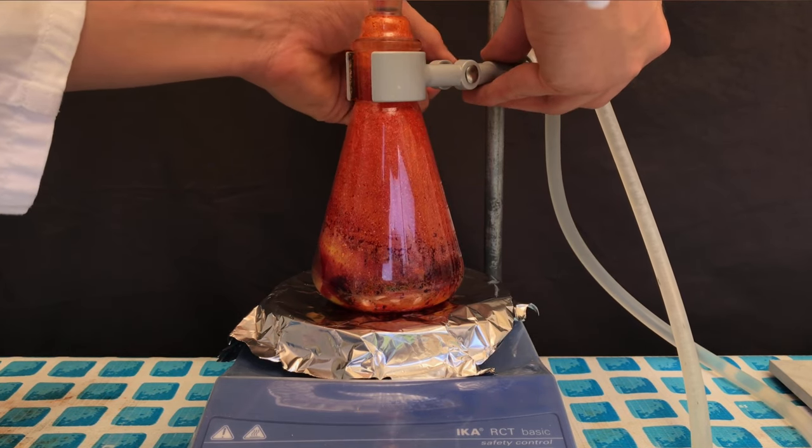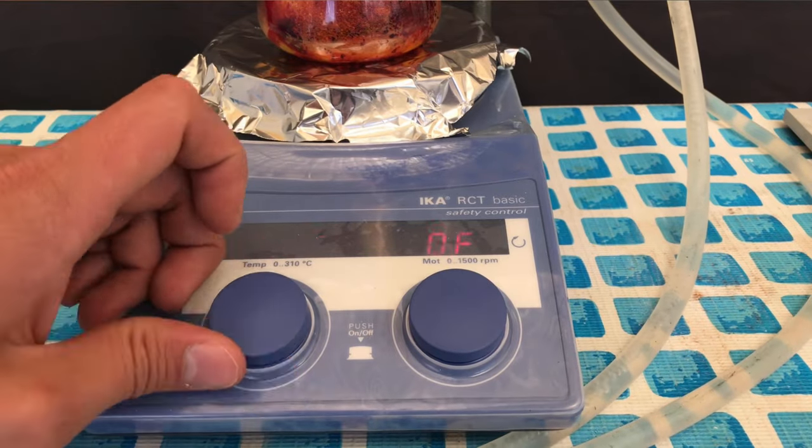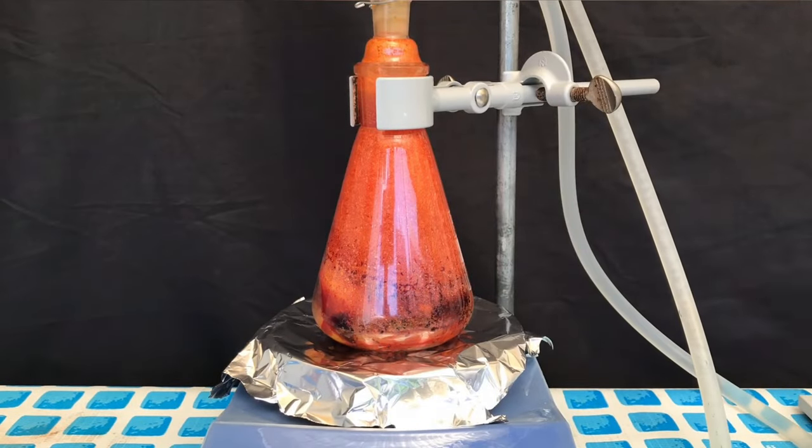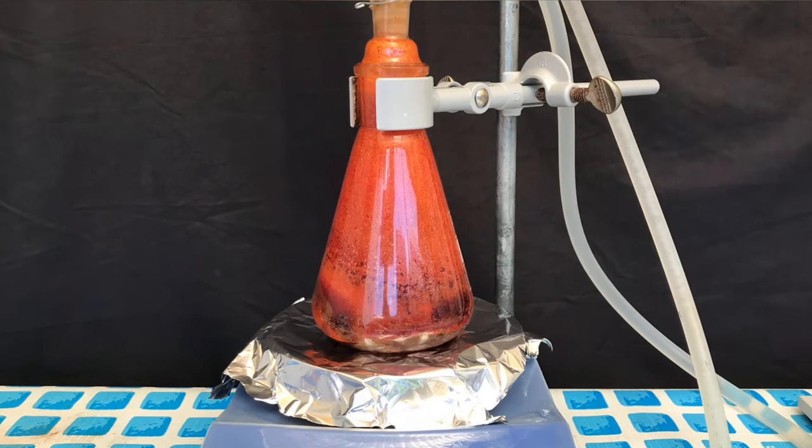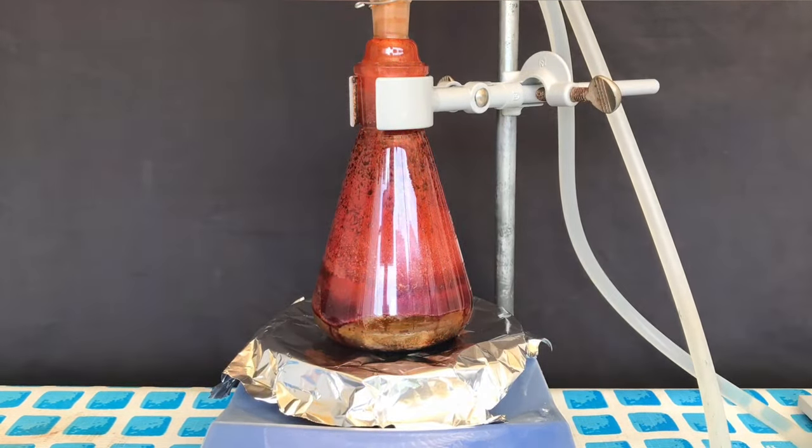Therefore, we will have to perform a reflux. Leftover bromine is going to react with leftover phosphorus to form phosphorus tribromide and phosphorus pentabromide. Leftover phosphorus pentabromide will also react with phosphorus to form phosphorus tribromide, our desired product.